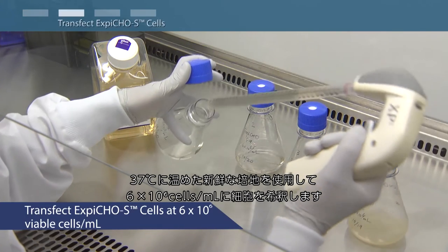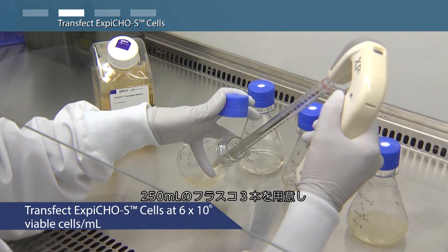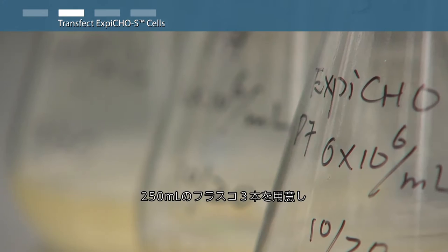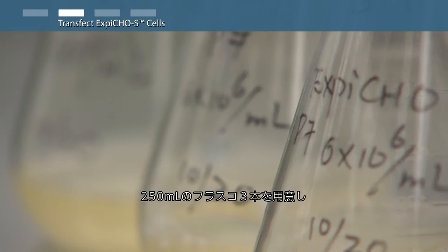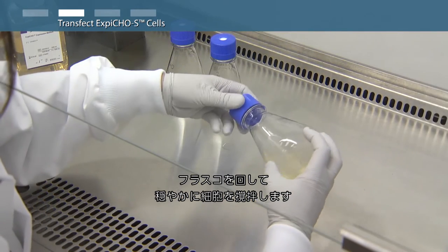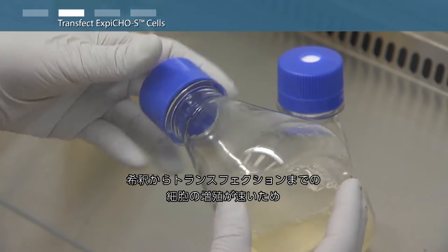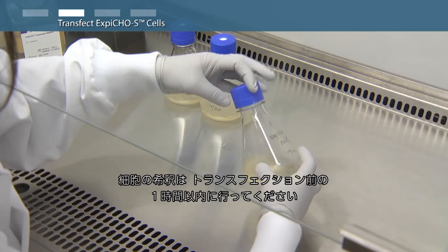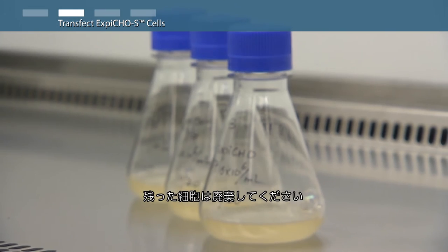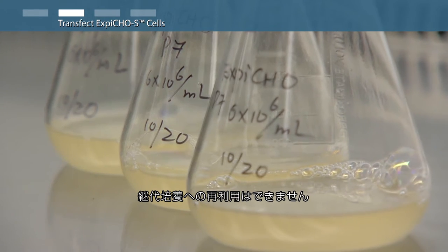Dilute the cells to a final density of 6 million viable cells per milliliter with fresh XBCHO expression medium pre-warmed to 37 degrees Celsius, with a volume of 50 milliliters in triplicate 250 milliliter shake flasks. Swirl flasks gently to mix the cells. Only make this dilution within an hour or less prior to transfection. Discard any remaining high-density cells; do not reuse for routine subculturing.